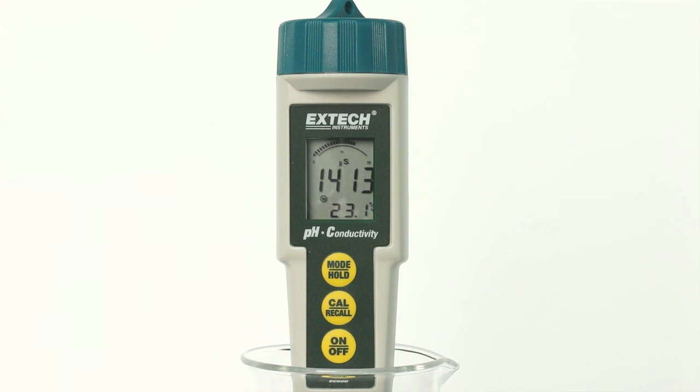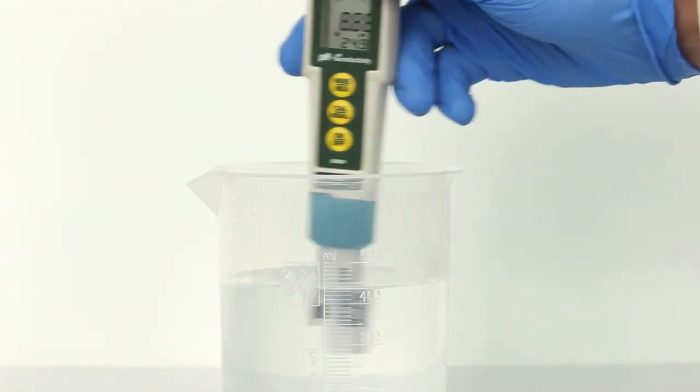L for low range, M for medium range, or H for high range. Properly rinse the electrode after use.